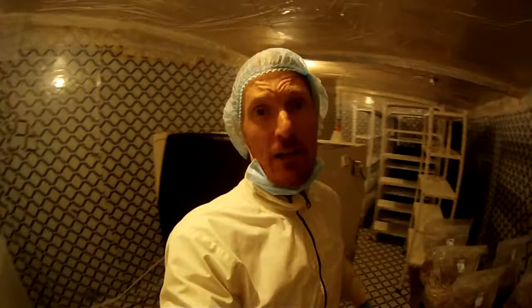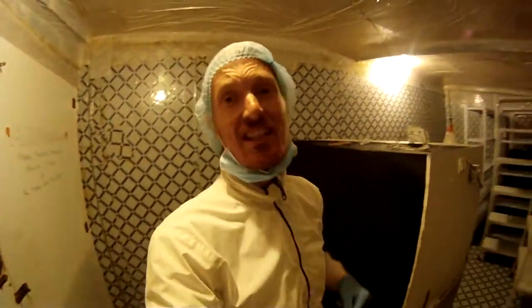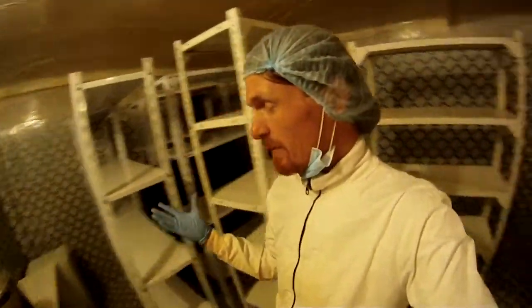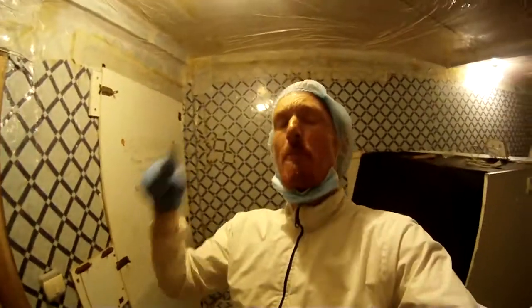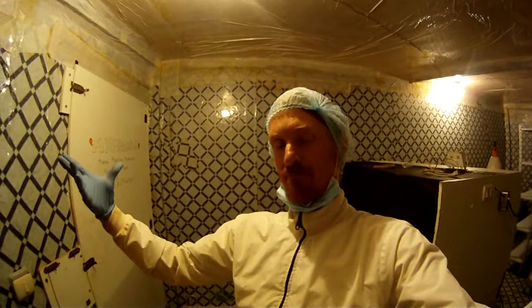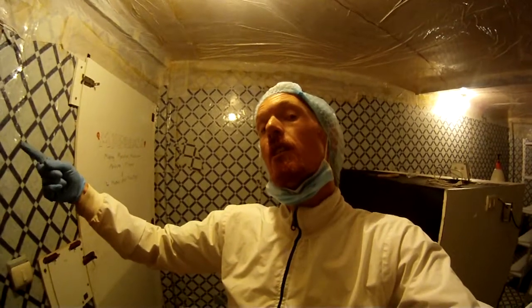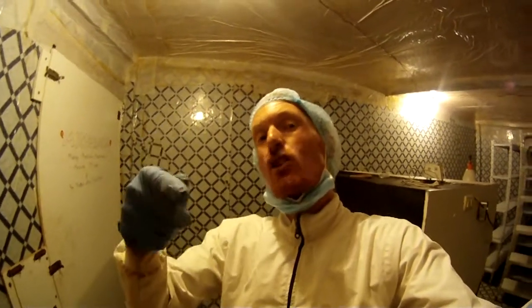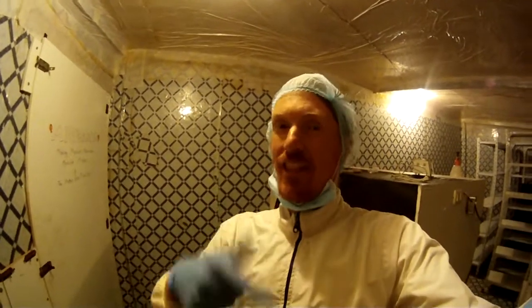That's basically it, folks - this is my lab. It is positive pressure, sealed so nothing can fly in like bacteria, insects, or things that would contaminate this zone. I just want to keep this space clean to inoculate my spawn. Thanks for tuning in - we're going to go check out the other components: the pasteurization station and the grow rooms. To wrap it up: the purpose of the lab is to create mycelium, and the purpose of the grow rooms is to create mushrooms. You've got to make the mycelium before you can make the mushrooms - just like you've got to grow the mango tree before you get the mangoes. Thanks for checking out my lab!